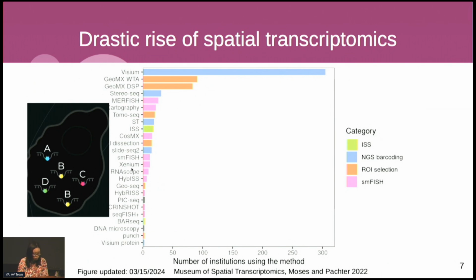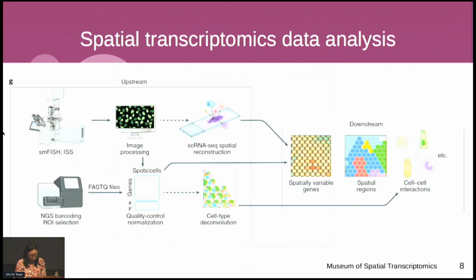However, usually these are not transcriptome wide, and so usually people would quantify a few hundred genes per dataset. But the number of genes is also increasing, with the new version of Xenium that has a 5K gene panel. So that's a very short intro to data collection for spatial transcriptomics.